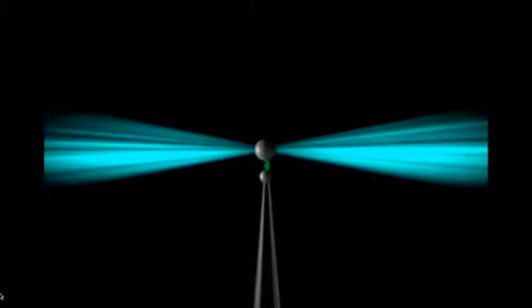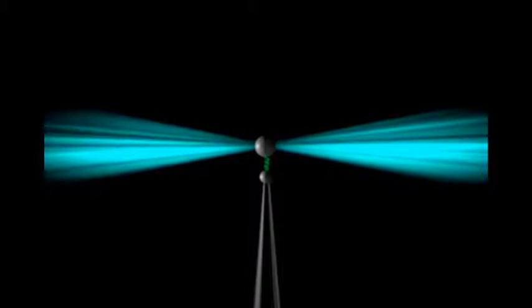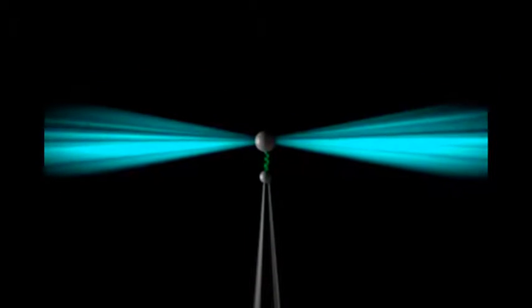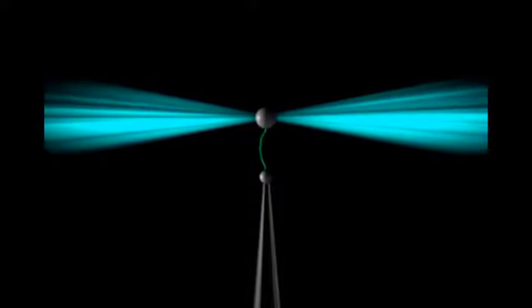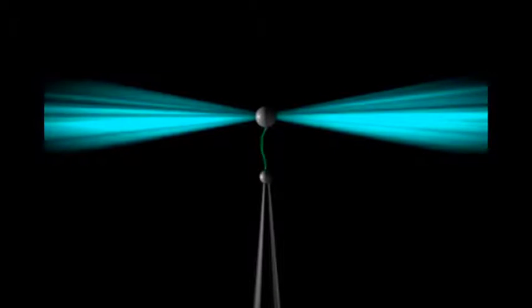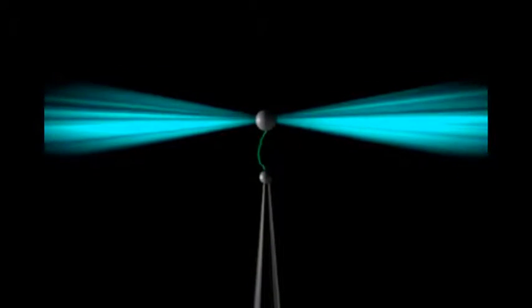As you can see in this simulation, highly focused laser beams are illuminated onto the microparticles to either move them or trap them. The laser beams generate two forces. First, the scattering force. This scattering force pushes the particle along the direction of the beam propagation. And two, the gradient force. This gradient force attracts the particles towards the focal point of the laser beam.